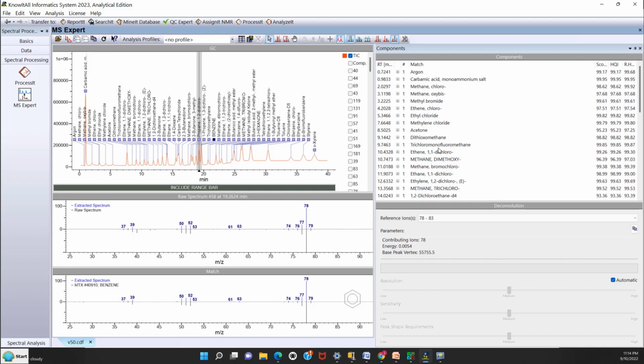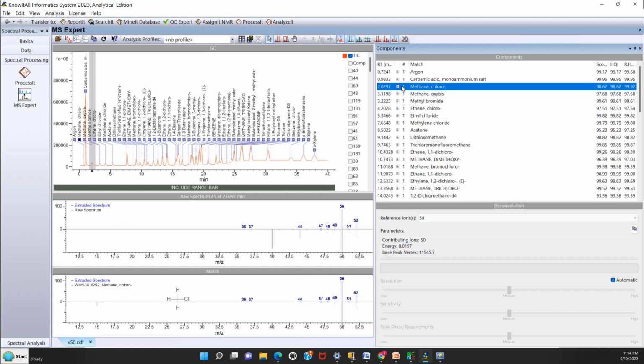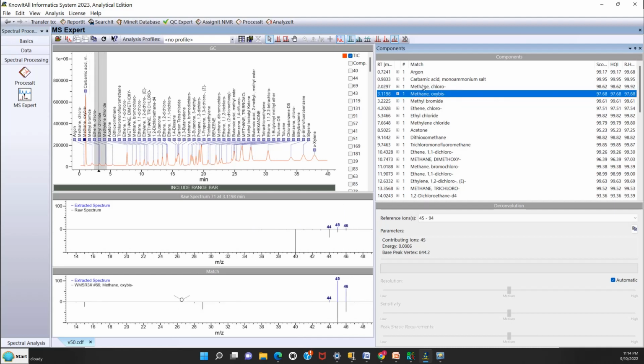If you come up to this right column and start clicking on the peaks, I've picked the first small peak. The first peak is a solvent peak of some type, and I've selected it with the mouse. It's highlighted in blue. Now I can use the up and down arrows on my keyboard to step through them. What I'm looking at, if you come over here, you'll see these scores, 97.68. So it's finding things with high hit quality index. The hit quality index is 97.68 here. So we're just stepping through some of them because I want to show you something at a later point.